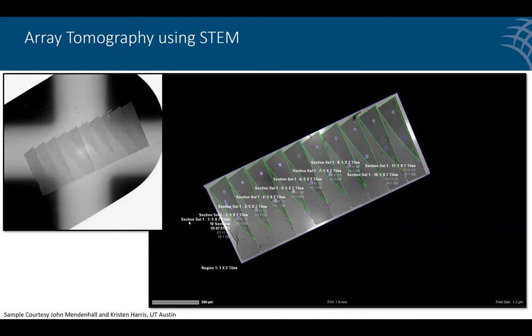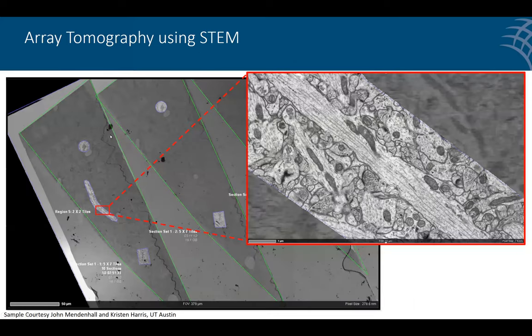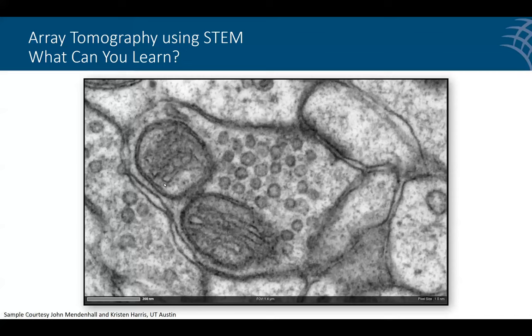Here's an example showing a slot in a grid with a ribbon of brain tissue sections. Using Atlas V software, you can do an overview map of the whole ribbon and start drawing areas of interest. Once you draw boxes for areas of interest, you can scan them at high resolution. Zooming in, you can see microtubules, mitochondria, and even further — synaptic vesicles, cristae, and mitochondrial membranes. This is the synapse itself. With STEM you get the highest resolution, you can see a lot of biology, and with array tomography you can make three-dimensional data sets from serial sections.